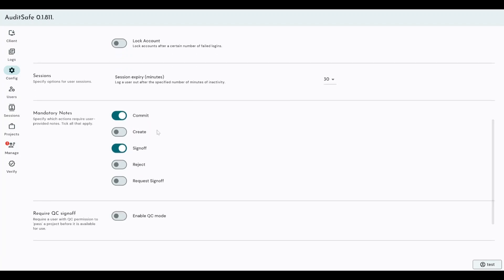We have the ability to force a logout if someone walks away from their computer, for example. So after a certain number of minutes of inactivity, the user is automatically logged out. And this applies to both the admin tool, this server tool here that I'm accessing, and the client.